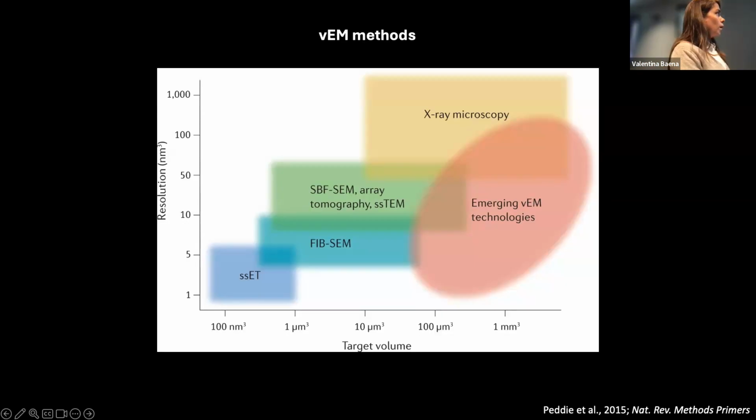But what I want to highlight here is the versatility of array tomography, which is it allows you to image structures as small as, for example, organelles within cells, or as large as whole organisms in the case of C. elegans or something around that size. Now, some of the limitations do come from the resolution, especially the Z resolution, because you're physically sectioning your sample. You have a limit in how thin you can section that.